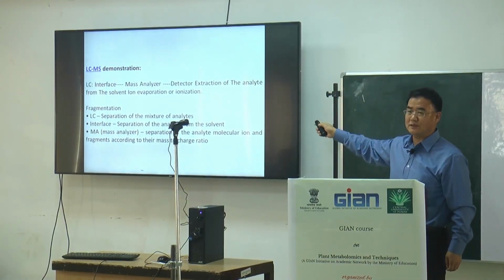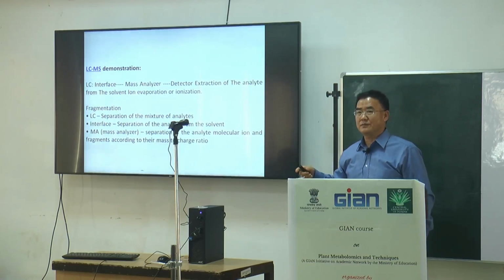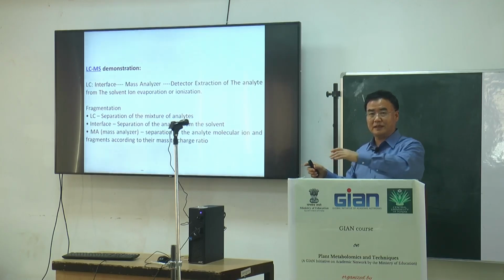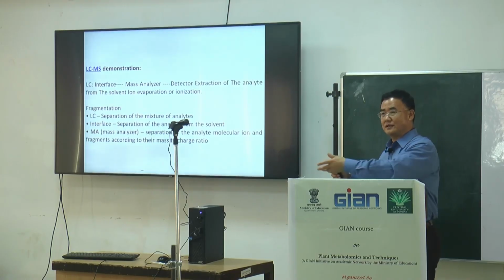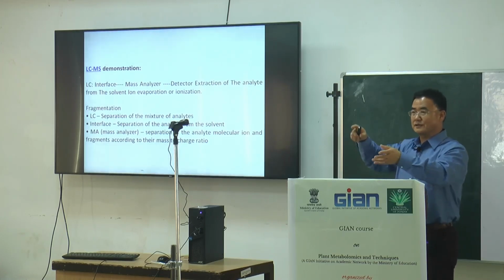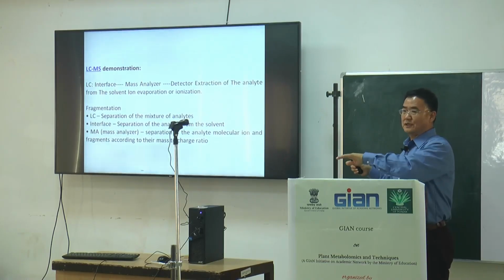This is also the core part of Q-TOF or Q-trap or other instruments, to isolate the ions, the already ionized particles or metabolites, the already charged ions. Q-TOF uses the time of flight in the electric field, it continuously accelerates, and the time of travel varies.